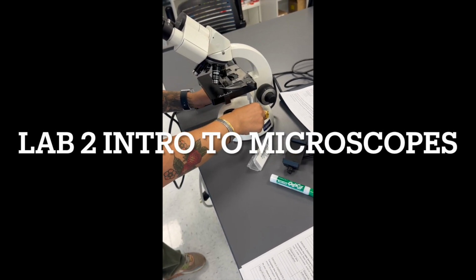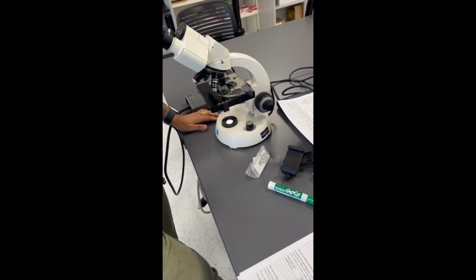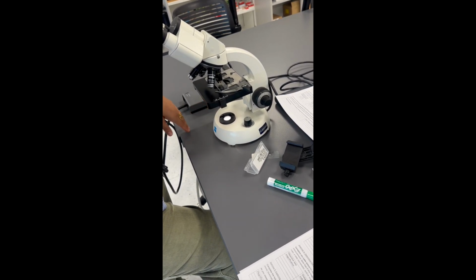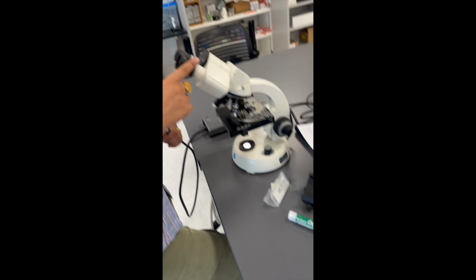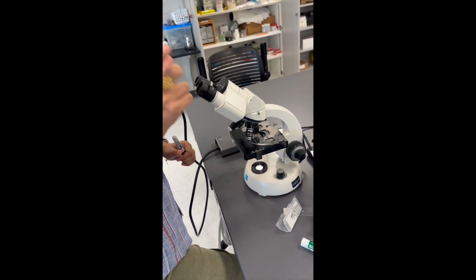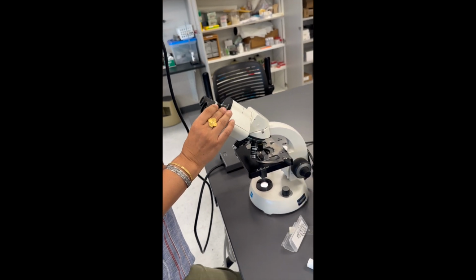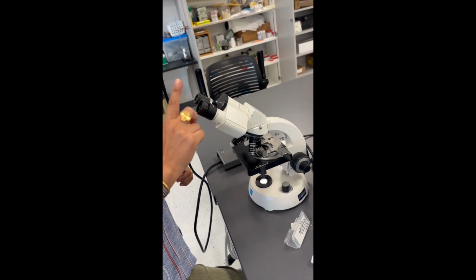All right, welcome to week 2 for Biology 1610, Intro to Microscopes. What we are doing this week is we are teaching students how to determine the distance between tick marks on their ocular micrometer. So the ocular micrometer is basically a ruler that we can see through the lens of this ocular lens. And we don't know exactly what the tick marks on the ocular micrometer measure without calibrating it.